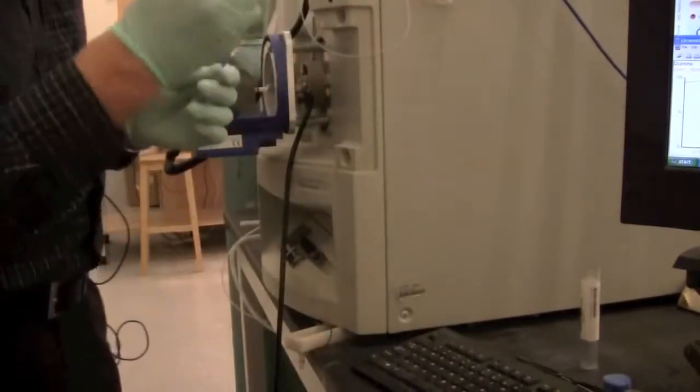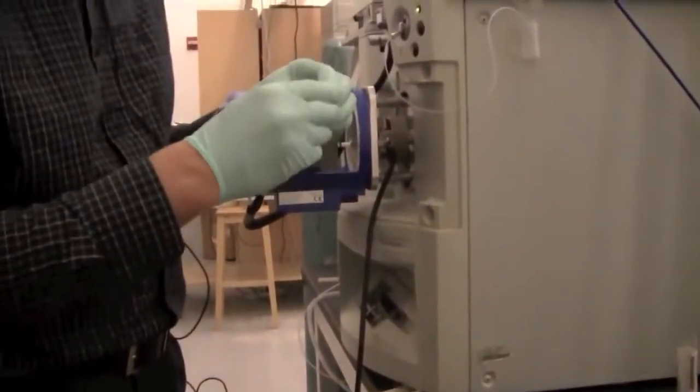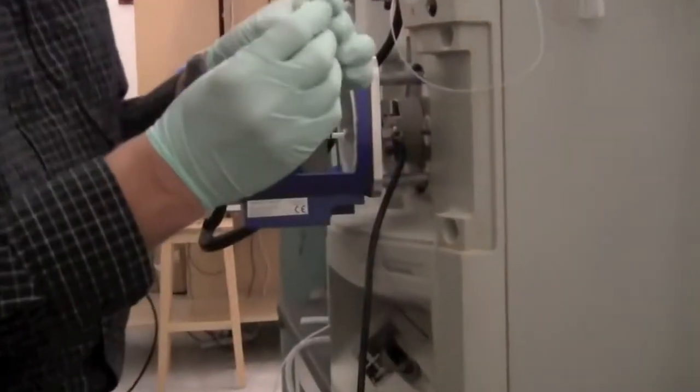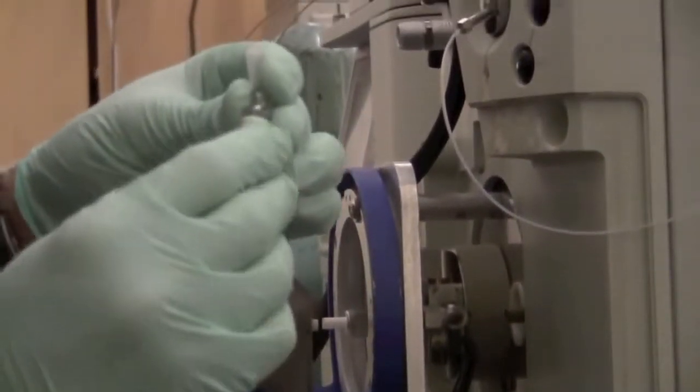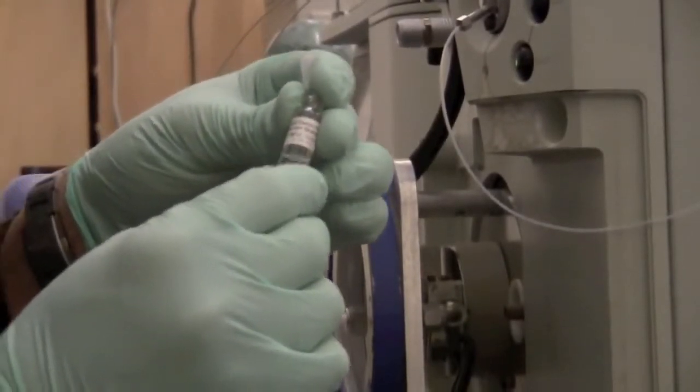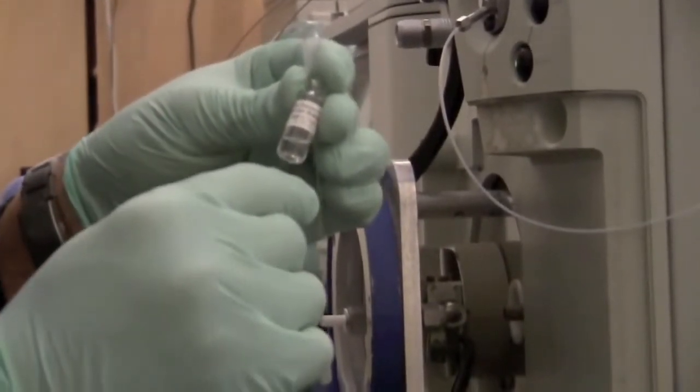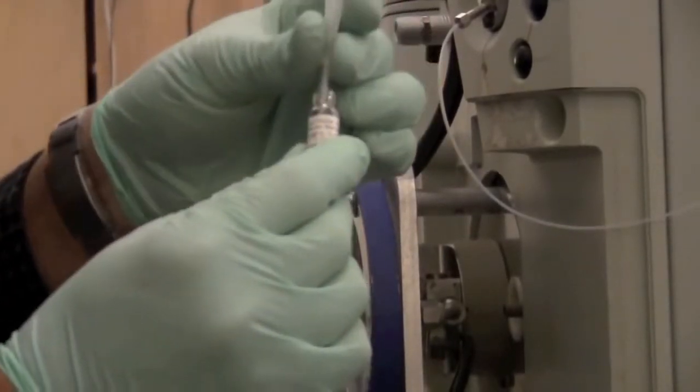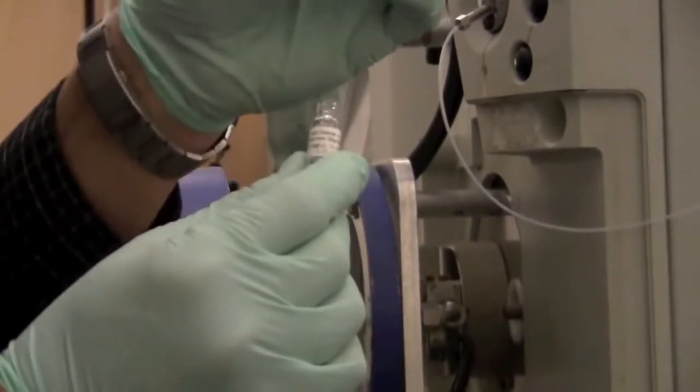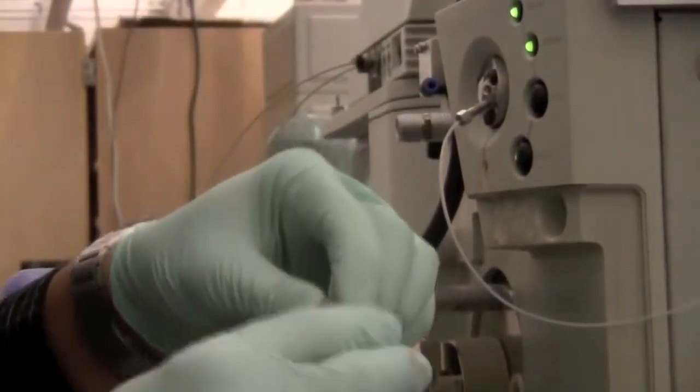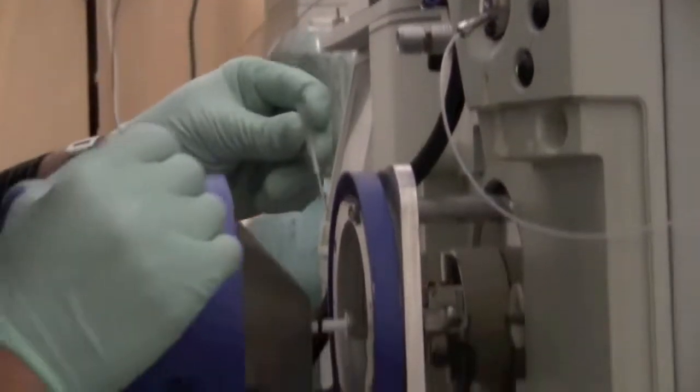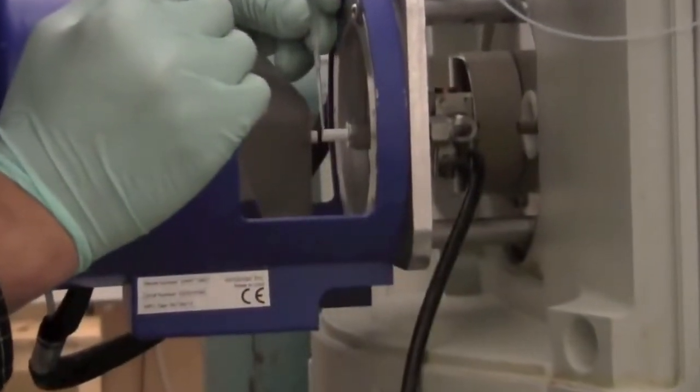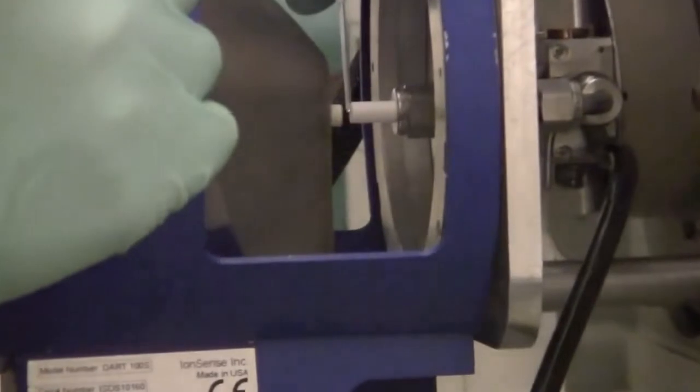For a solution, you can dip the capillary into your sample. This sample is quinine, 10 nanograms per microliter. Remember that mass spectrometry is a fairly sensitive technique. So you do not need the concentration to be all that high. So in this case, we can just dip the capillary into the sample. We can let it dry a little bit.